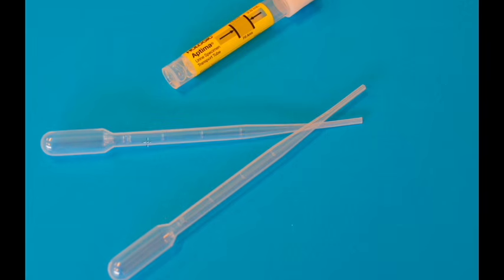Let me show you. This is the pipette. This bulbous head here, you can press it, and it creates some suction. If you press here and hold, you can put this pipette into a solution, and then you release, and the liquid will be sucked in.